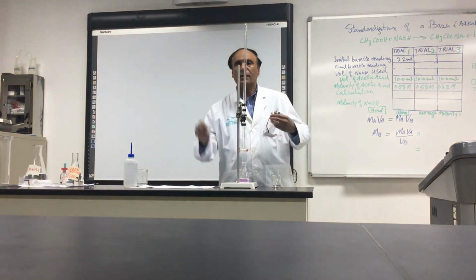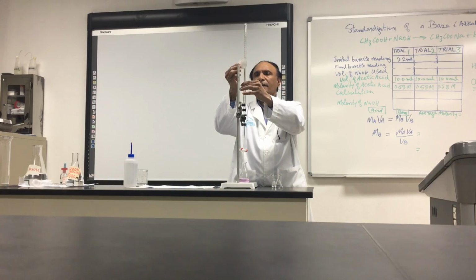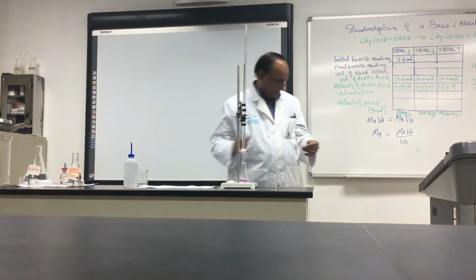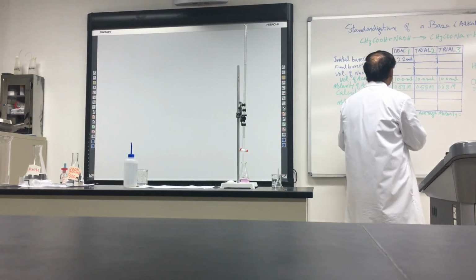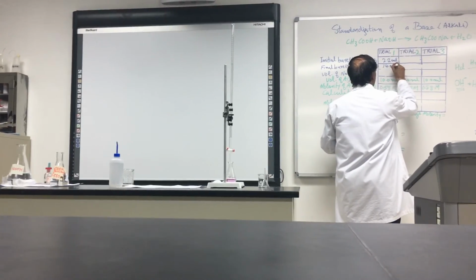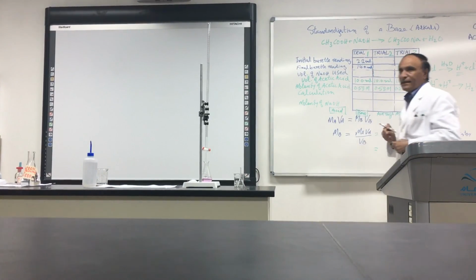And then you record the reading. It is 14.0. So the final reading is 14.0 milli. Did you see that?